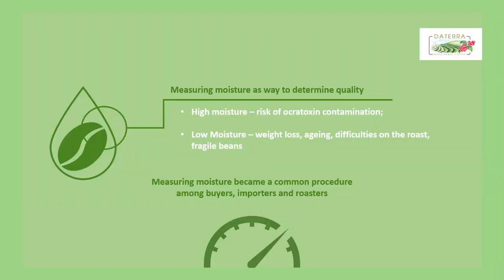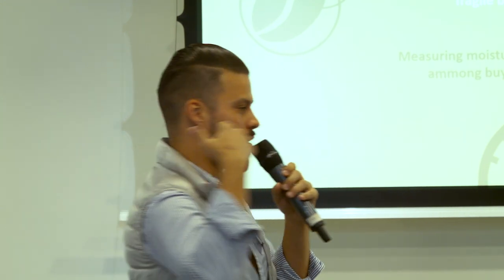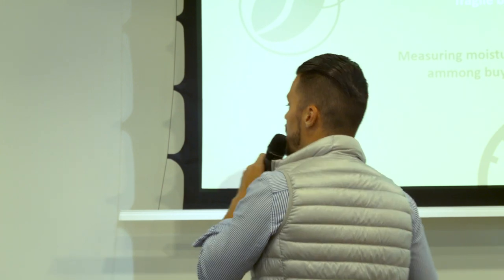But what this is about is the moisture measuring protocols. Measuring moisture became a very common procedure in our industry. So who here owns a moisture meter? Raise your hand. Or the company you work for? Yeah. Most of the people in the room, either because you are a coffee buyer or a roaster or a producer, have a moisture meter. You want to check if your coffee is at the right moisture level. So this is something that's pretty standard.